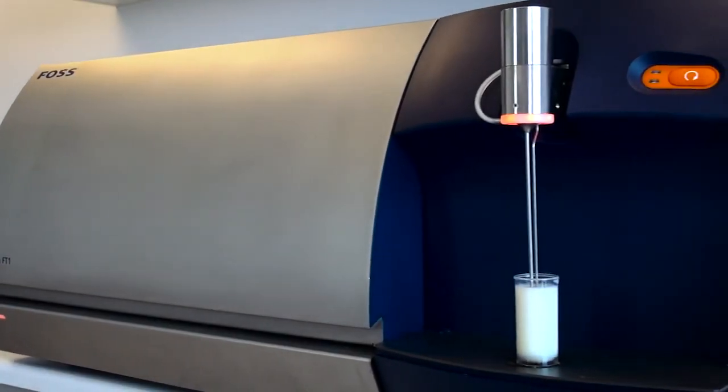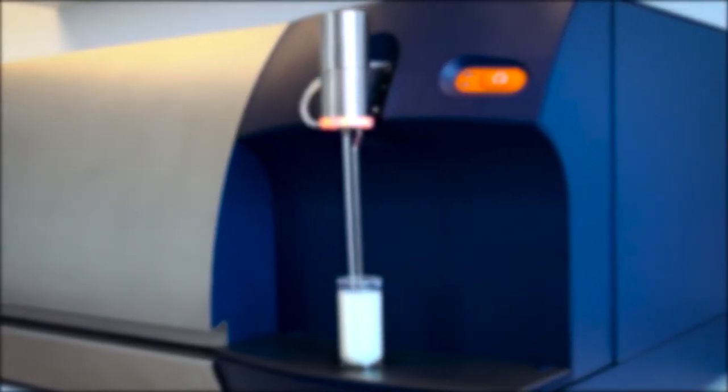Milcoscan FT1. The gold standard in dairy analysis.